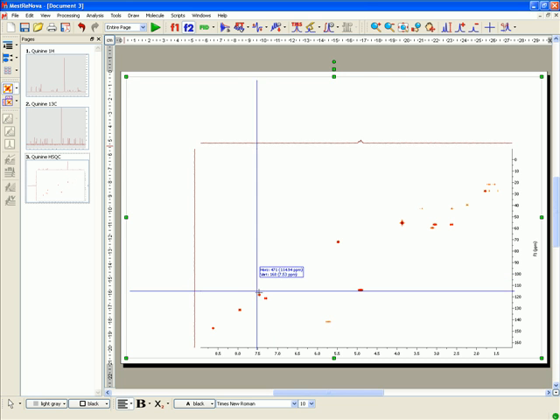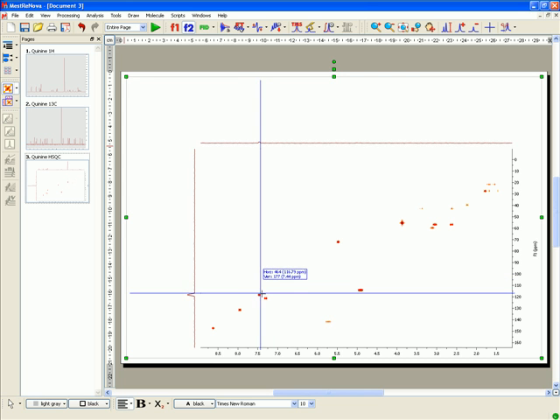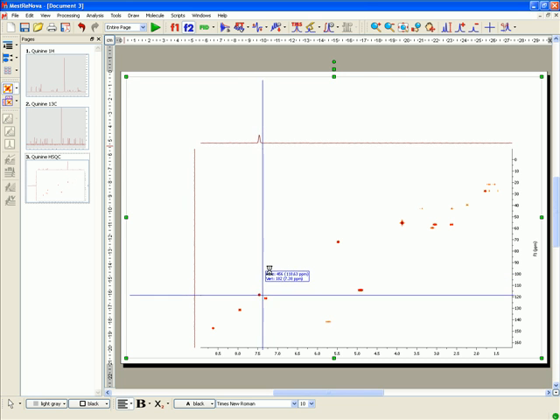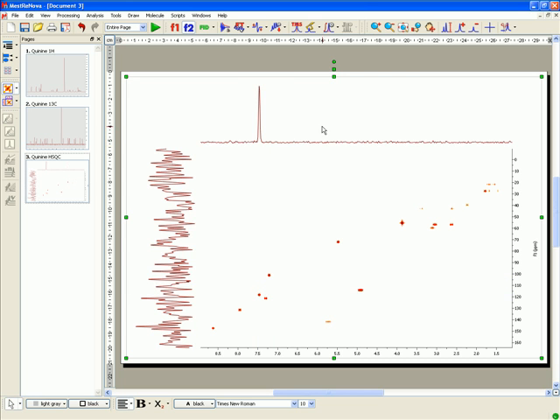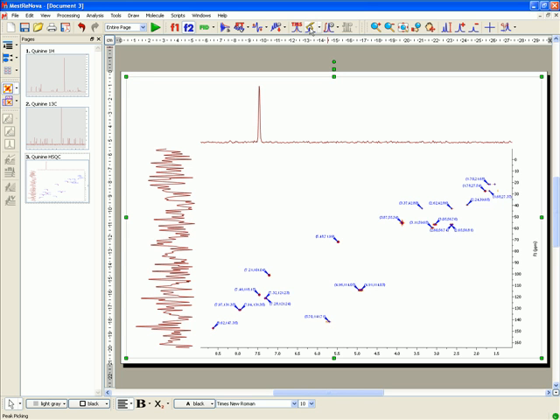Click on the Peak Picking and on the Integration icons to obtain a fully integrated spectrum with a Peak Picking analysis.